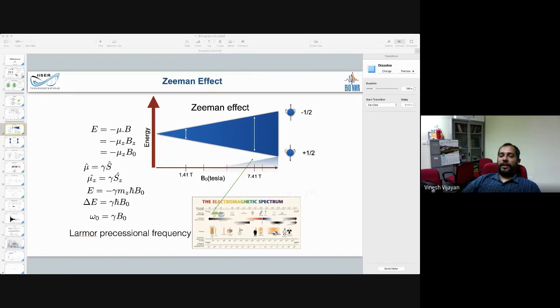Normally, for chemical shifts, you get a fairly good idea, but you cannot completely rely on it to predict or calculate chemical shifts from the experimental one, because that would be the easiest thing to do, especially for biomolecules. You do some calculation and you get a chemical shift. People have been trying to represent accurately the experimental chemical shift with that of the measured.